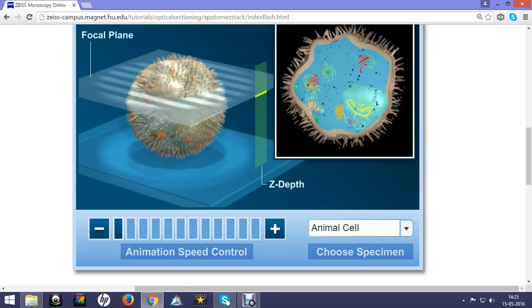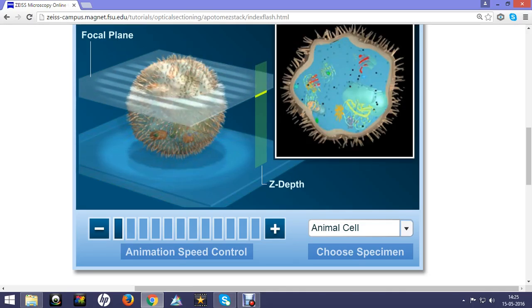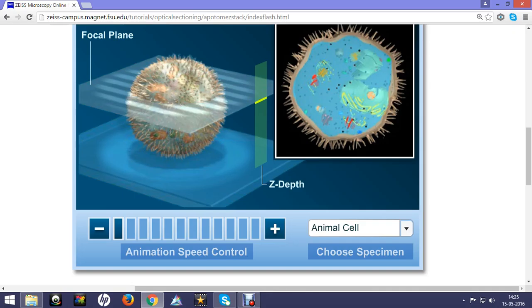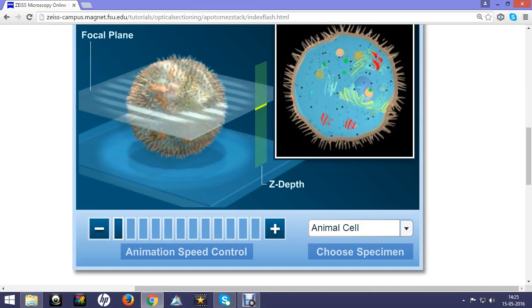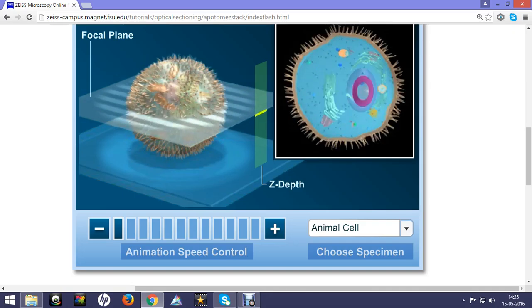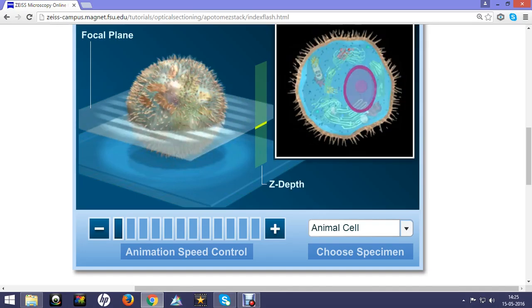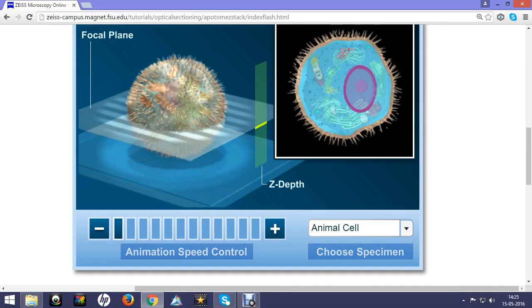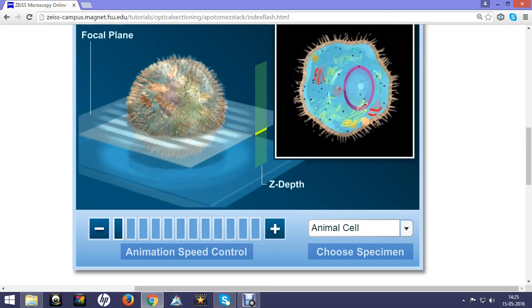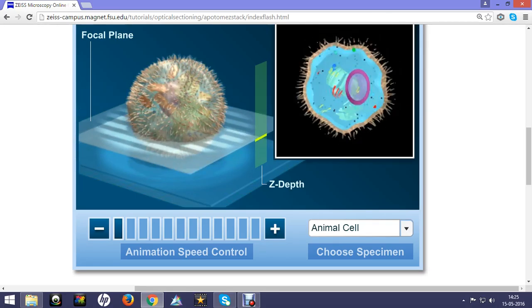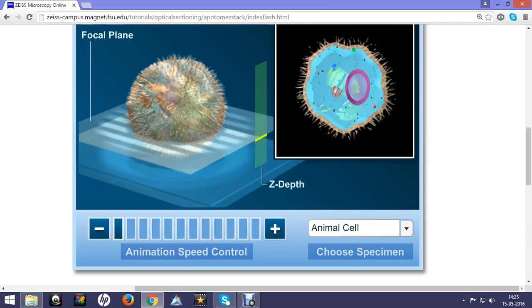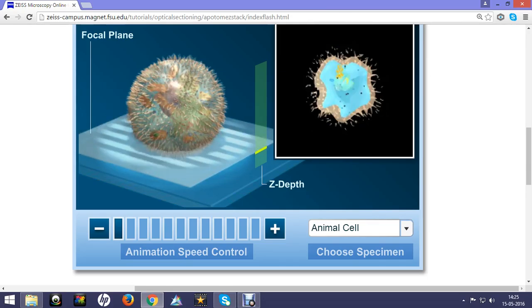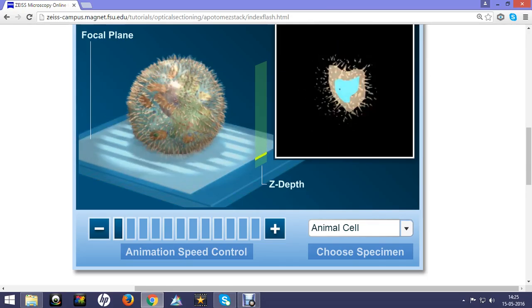Now the cellular details are significant when it goes into the deeper focal plane. The amount of cellular details is decreasing and the microscope takes the image from the deeper focal plane to the topmost focal plane.